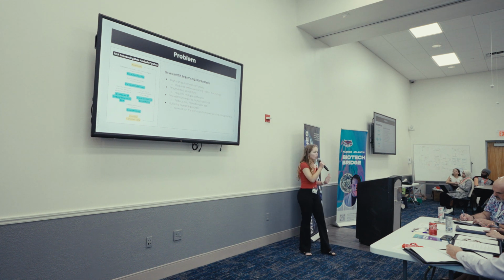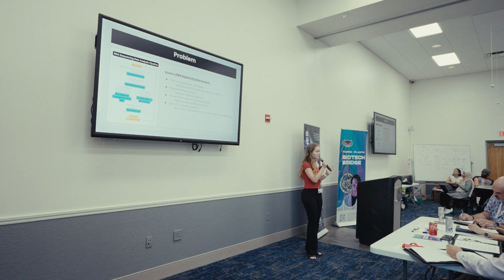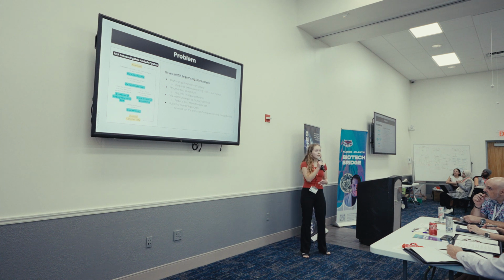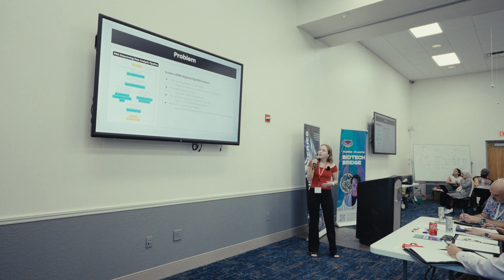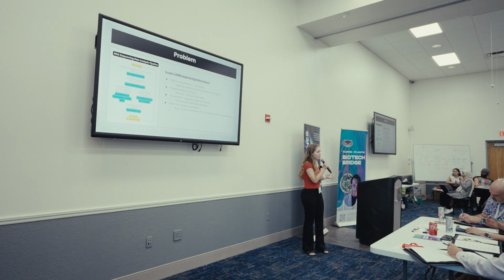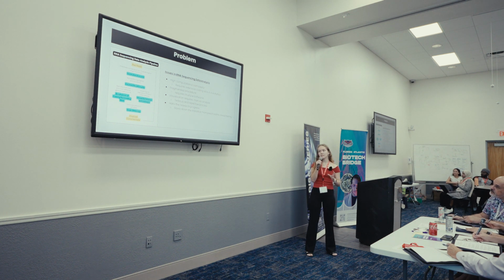So the issue with RNA sequencing data analysis is, first, it takes a high level of technical skill for someone to be able to do data analysis for RNA sequencing. Now, you can imagine why this would be a challenging issue in biomedical science, as the people conducting the research are not familiar with systems such as R and Python. Additionally, the procedure for doing the data analysis is quite fragmented. It takes several different softwares, and it's very tedious and repetitive.